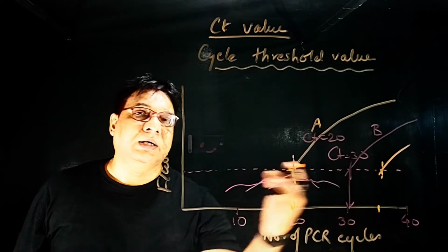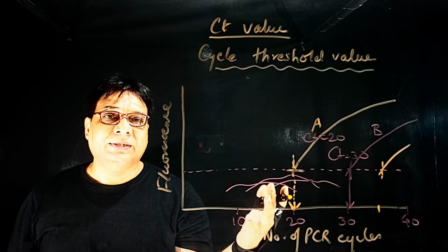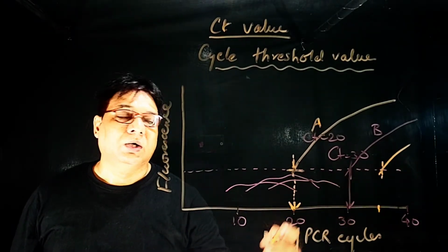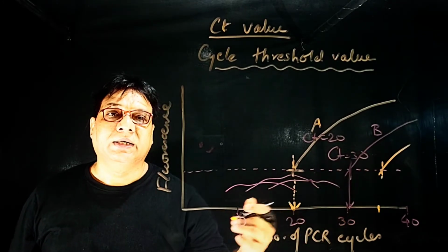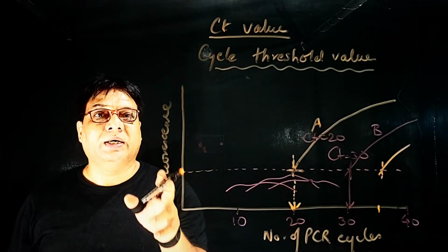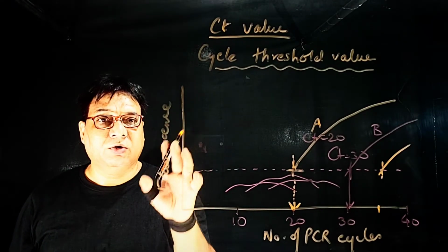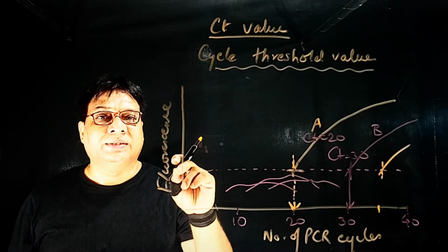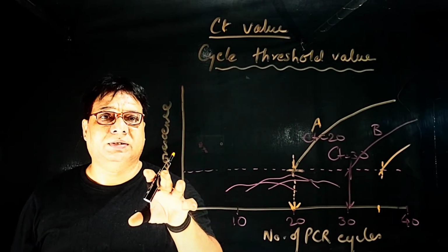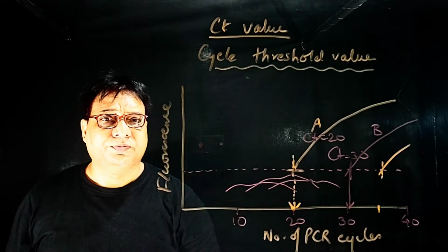Or in case of the other variants which were more contagious, I don't know whether ICMR have shifted the CT value to 36, 37 or 38. If they shift it, that will indicate that that particular virus is even more potent than the previous one. That means inoculum potential is less. It can cause disease even in a smaller dose. So this is the concept of CT value.